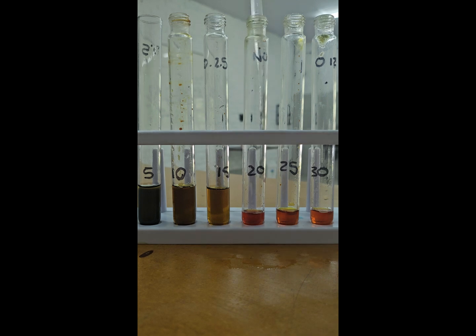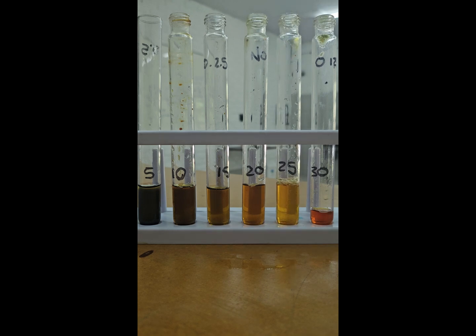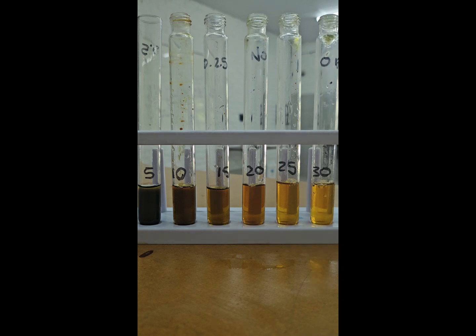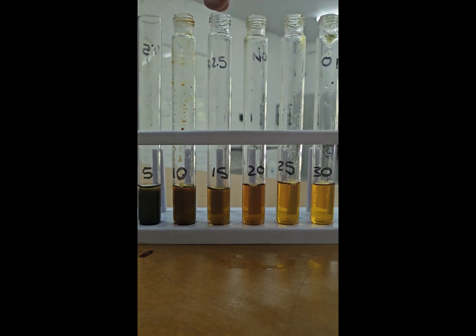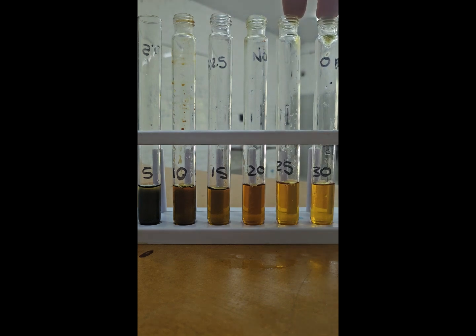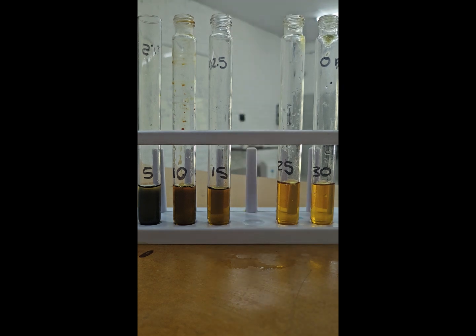Then, of course, after 20 minutes, I can add my starch solution to the 20 test tube, and here I can see that not much of the color has changed at all. Then after 25 minutes, I can add it to my 25 test tube, and here I can see literally no color change, and the same for 30 minutes, no color change. So I can see that there's a decrease in concentration from the 5 minutes to the 20 minutes, but between 25 and 30 minutes there was no starch present in my solution, and all the starch has been hydrolyzed into maltose and glucose.